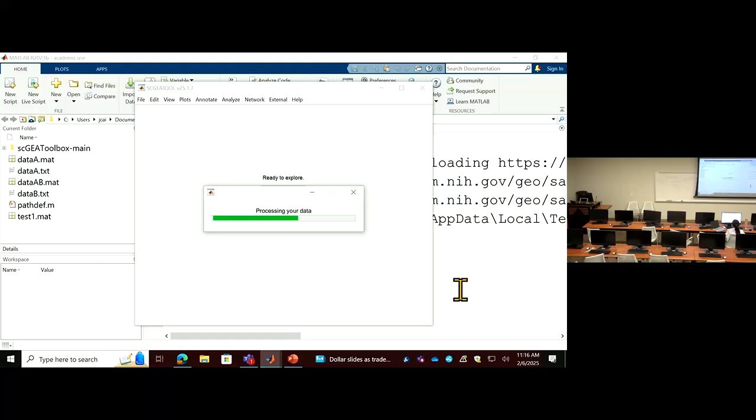So you can go ahead and just do the filter, because the filter will take some time. Then the first one, say okay. Then you just select. Just do a filter to make it smaller. It takes some time.